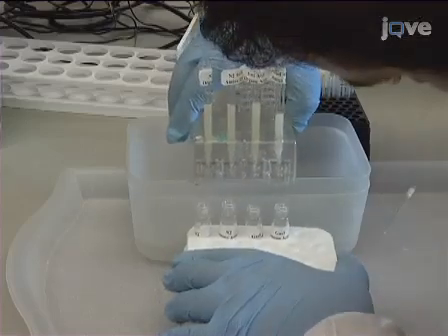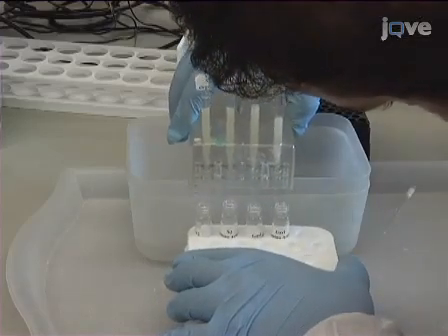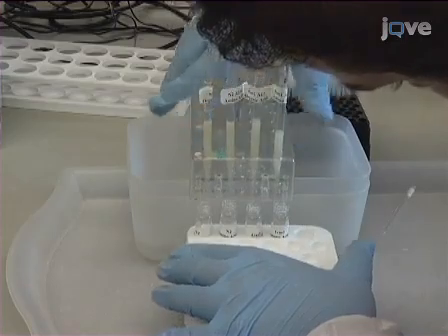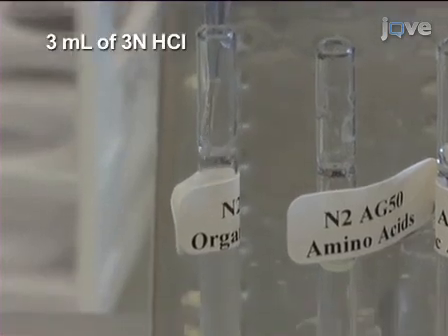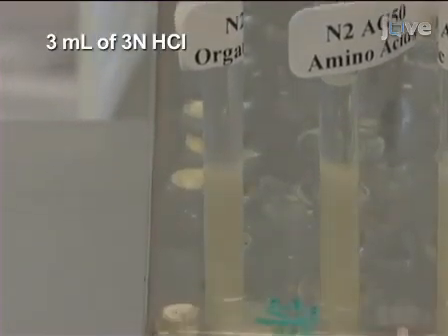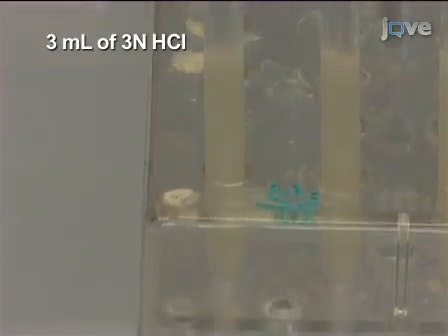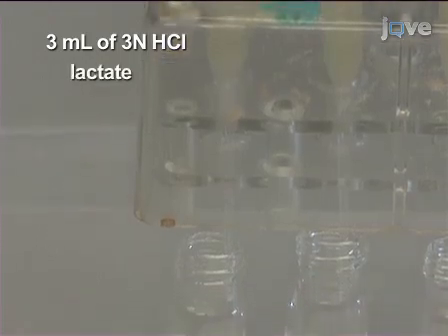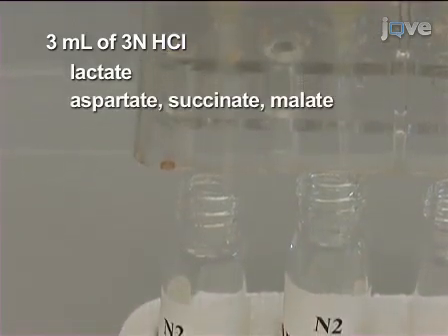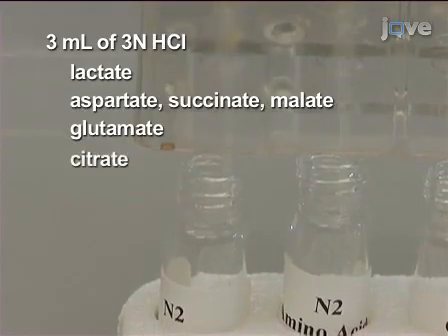After the washing is complete, elute each column to fresh, labeled 4 milliliter glass sample vials. For organic acid extraction, add 3 milliliters of 3 normal hydrochloric acid to the Ag1 column. This permits analysis of isotope enrichment in total number of labeled carbons among 3 carbon species, 4 carbon species, 5 carbon species, and 6 carbon species.